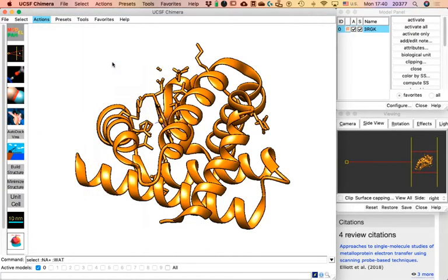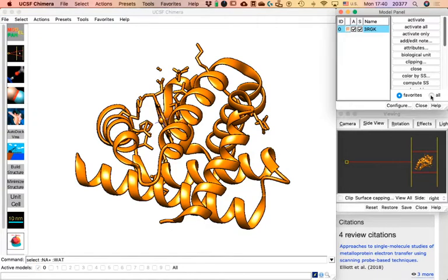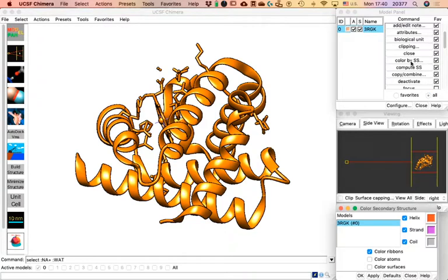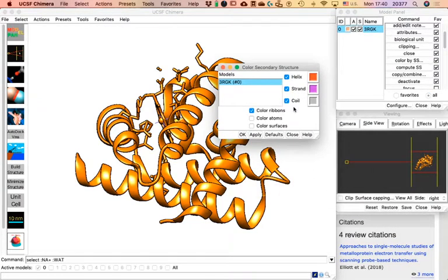Click on 'All,' then find 'Color by Secondary Structure.' I want to caution you about this interface: when you have the option to click OK or Apply, the difference is subtle. If you click Apply, whatever changes you've made are updated on the screen and the window remains open. If you click OK, the changes are applied and the window is closed.